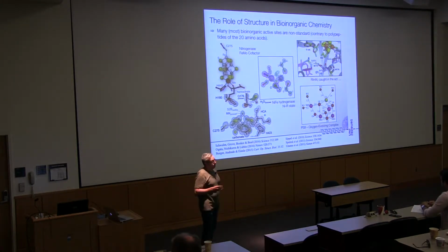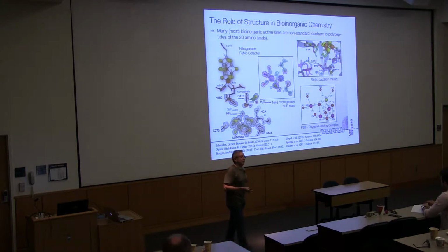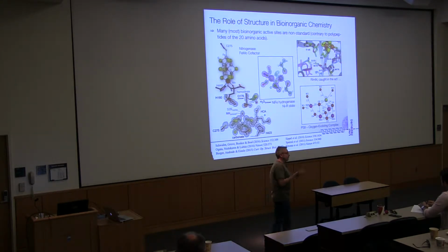So Frank Neese pointed out yesterday that crystallography is the kind of technique that only gives you the geometric structure of a molecule and nothing more. That's correct in many ways. On the other hand, imagine we wouldn't have that, right? So I remember starting out in a time when it was still kind of a luxury to have a three-dimensional structure, and nowadays you feel extremely limited in what you can do if you don't have this as a starting point.